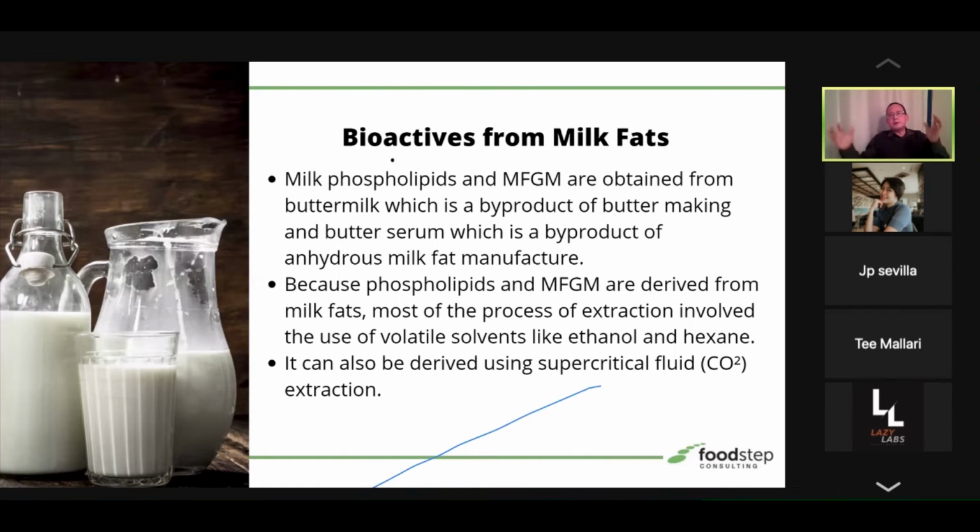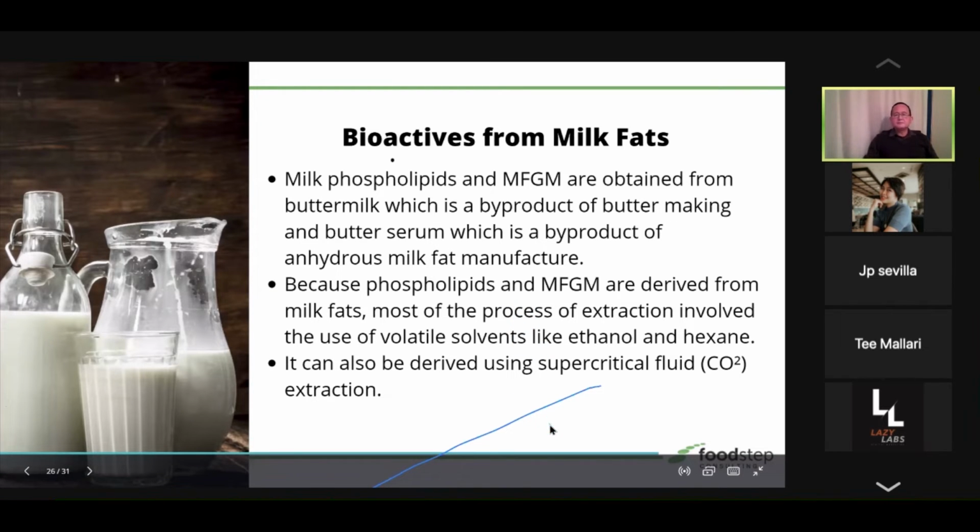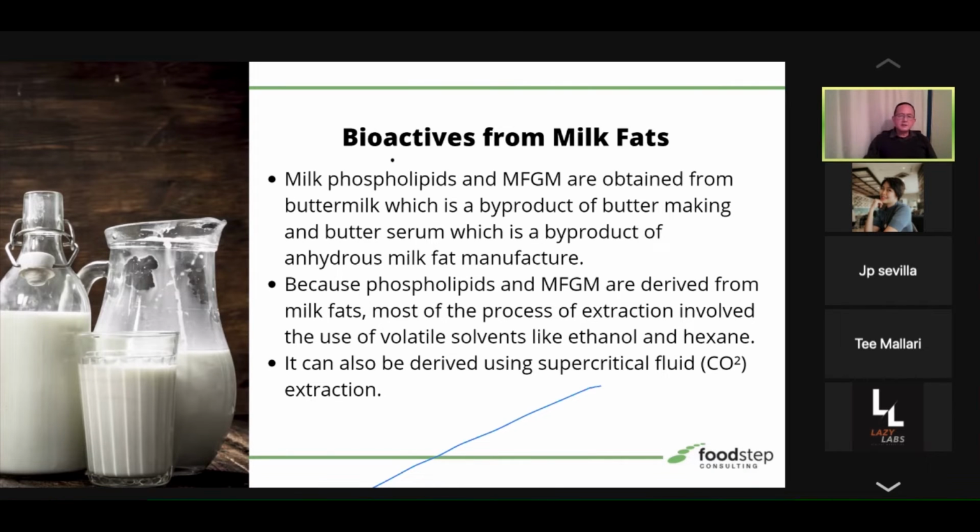direct this CO2 into a chamber where milk powders are present, like whey protein powder, at a particular temperature and pressure, it is what is known as a supercritical state. The CO2 will go into the chamber and behave like a liquid, so it will flow like a liquid, but partly it's also a gas. So that's why it will be able to dissolve the phospholipids present in the whey proteins. So this is another advanced process. Anyway, that's how it's done. Next, please.